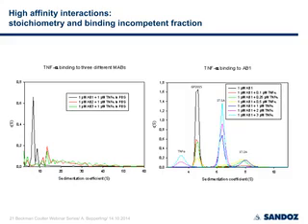Here an example shown for 3 anti-TNF-alpha binding proteins. There you see you have one antibody forming very small complexes and 2 other ones forming quite high molecular weight complexes. And when you have a closer look, this is the antibody 1. You see free TNF-alpha, free protein. You see complex 1-to-1 forming, and also at higher concentrations a 1-to-2 complex forming. This is a good basis, for example, if you afterwards analyze your proteins via ITC or for tighter interactions using surface plasmon resonance to impose a model.